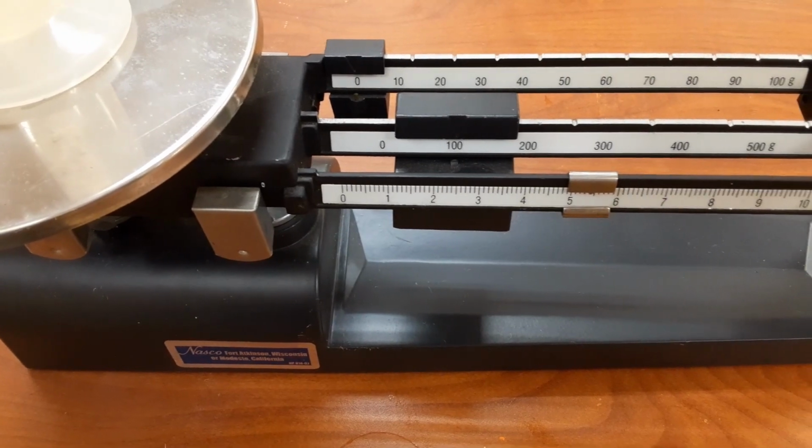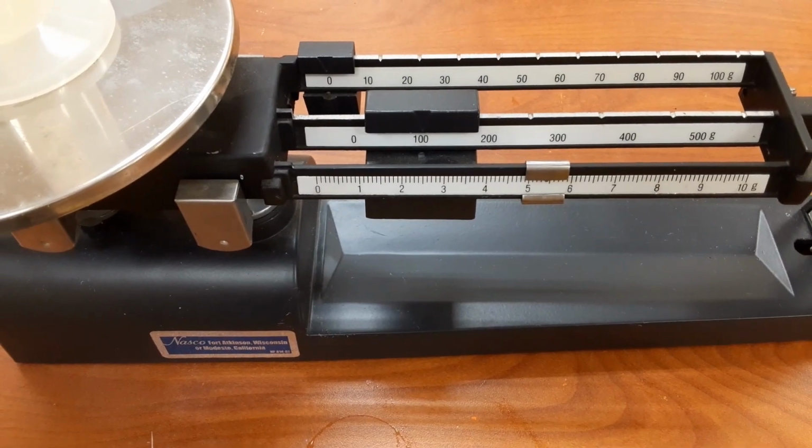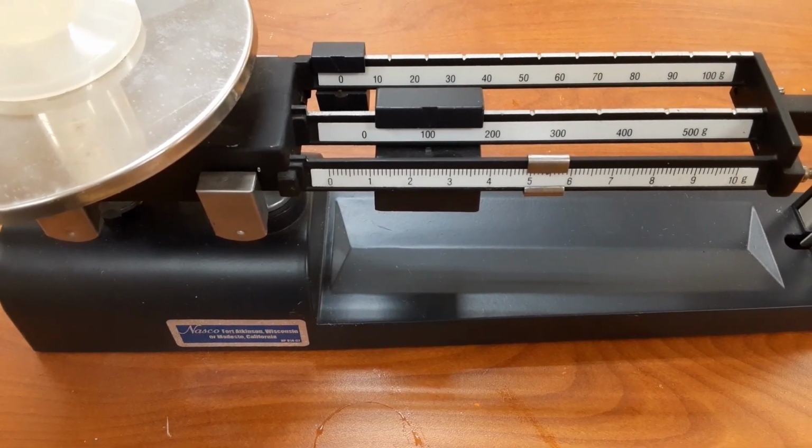Now, how do I get the mass of the water? Is by subtraction. So go ahead and find the mass of the water. Once you have the mass of water, you can find the density by dividing the mass of water by the volume of water.